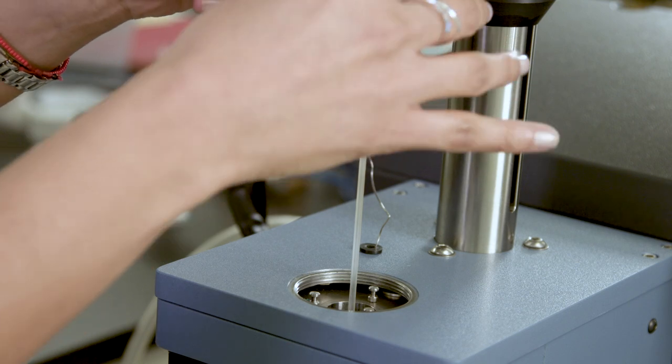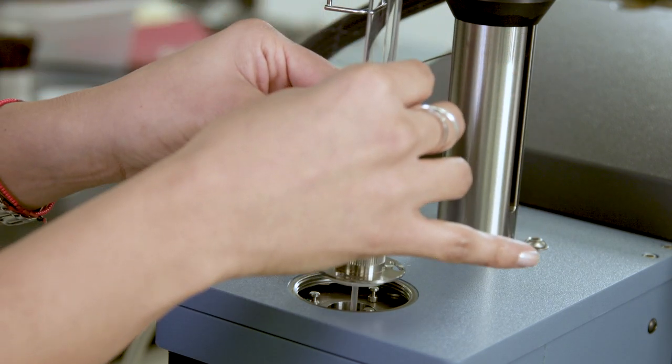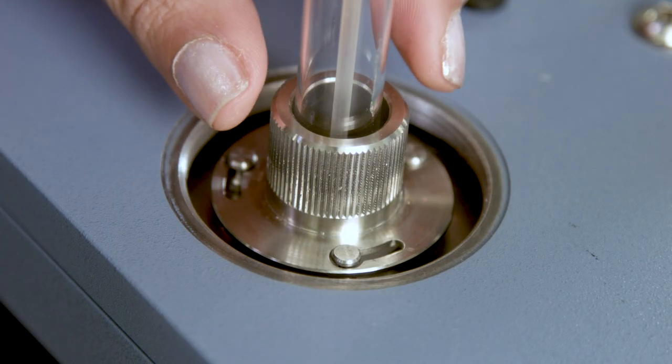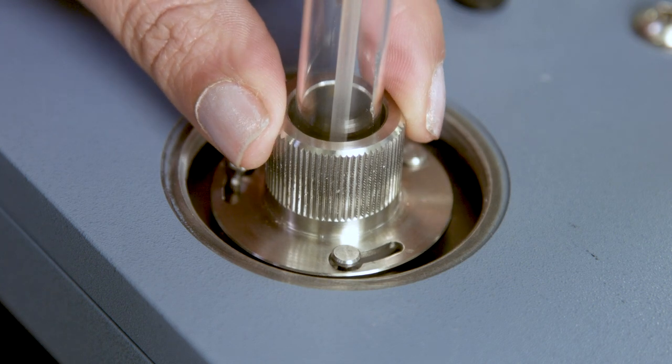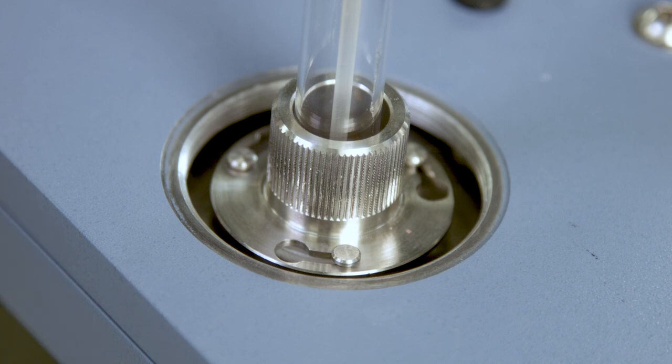Insert this assembly into the stage opening, aligning the key slots in the retainer ring with the posts. Press down and turn the retainer ring clockwise to lock the assembly in position.